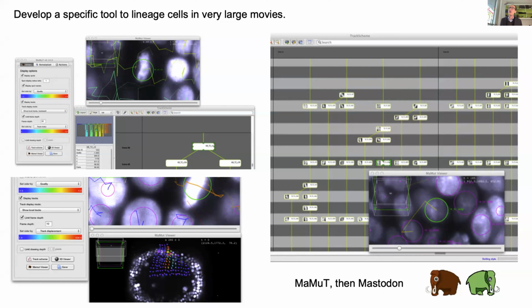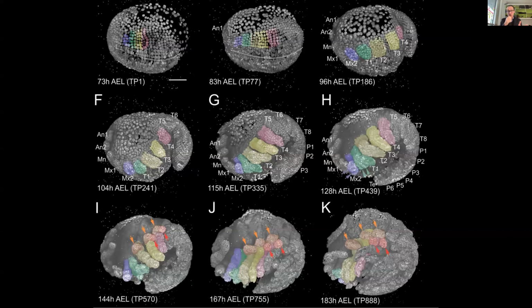The movie I just showed was acquired probably 10 years ago, exceeding the lifespan of a shrimp by a lot. And having the user-friendly tools that allow to browse and investigate this development took us time. But my collaborators and I, that's the lab of Pavel Tomancak and Anastasios Pavlopoulos, now in Crete, could use that to actually follow this development and backtrack the digitations. In particular, they were able to prove that one of these digitations always emerged from a single row of cells that you see here. These are the stem cells of the digitation that you see.